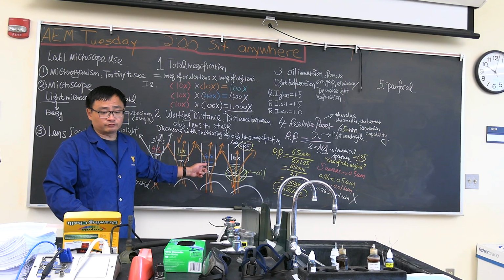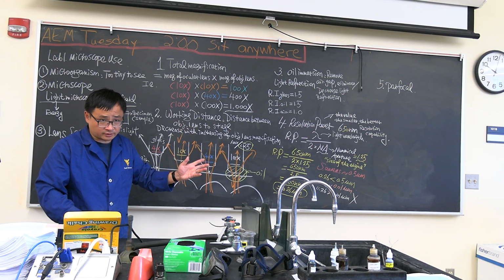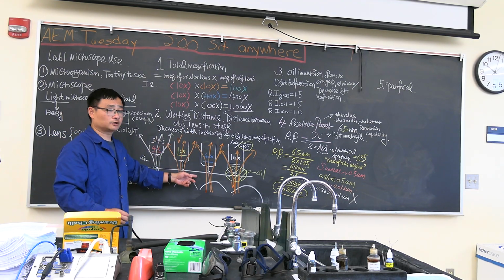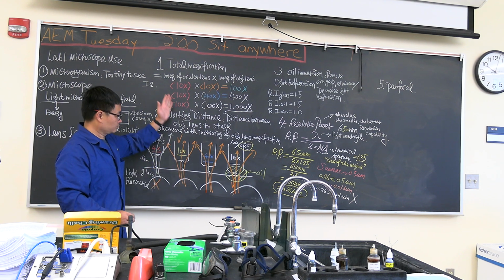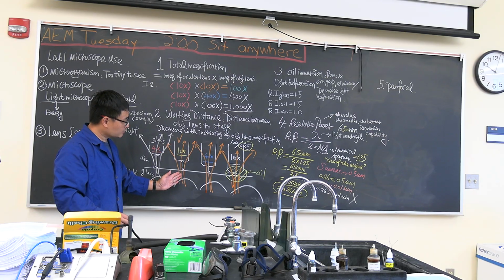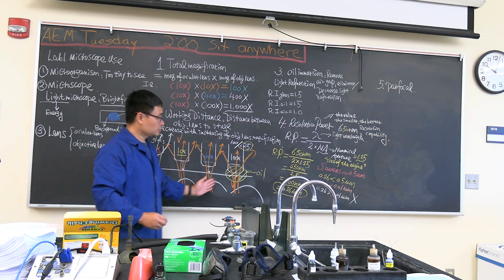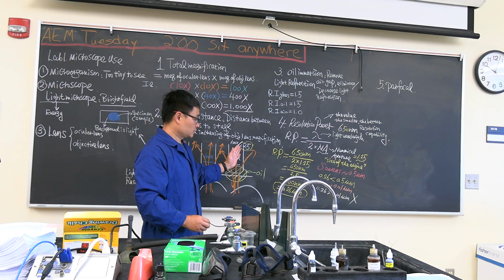When the class moves to sometime later in October or early November, when we observe pathogenic molds in very moldy bread, we will use it only once. So the whole class will stick to the yellow line, the 10x objective lens, then oil immersion, switching to 100x with oil.